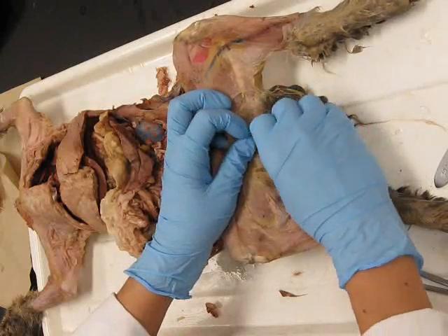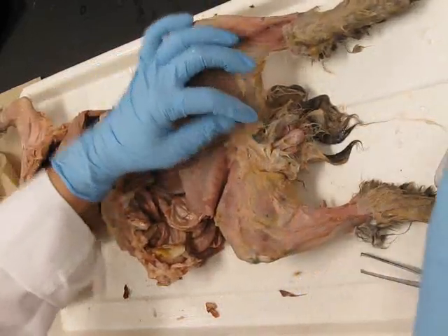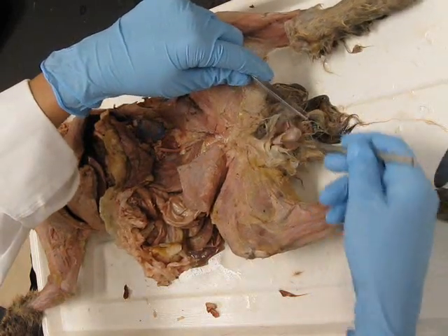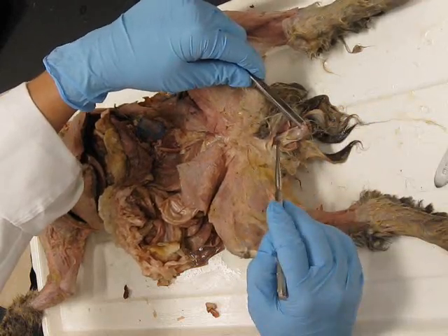Now you're going to give the testis a little pull to elongate the spermatic cord. Remember, the spermatic cord is a connective tissue sheath that is going to wrap the vas deferens, the blood supply, lymphatics, and nerves going to and from the testis. You can see this is a wrapping, connective tissue wrapping, spermatic cord.